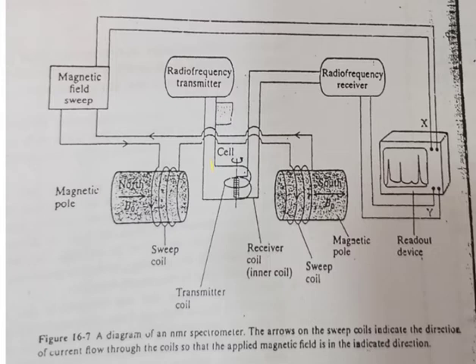The radio frequency transmitter emits light. This light can be absorbed by our sample molecules or the sample protons, and then this signal gets transferred toward the radio frequency receiver and then to the readout device. So this is the diagram of an NMR spectrometer, and the arrows on the sweep coils indicate the direction.